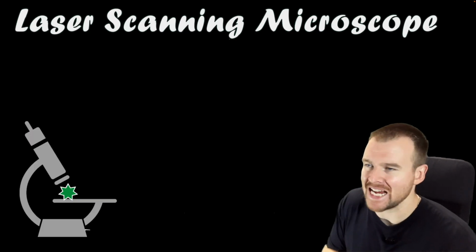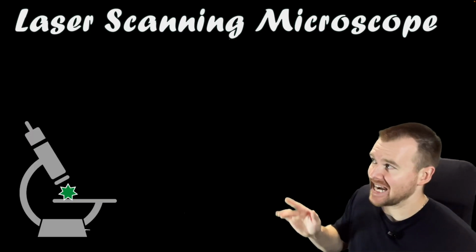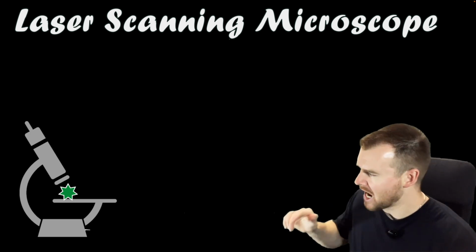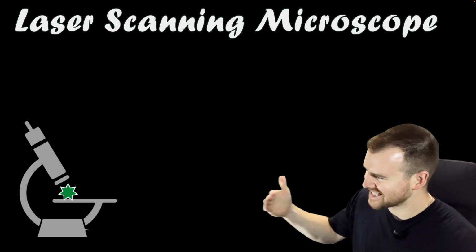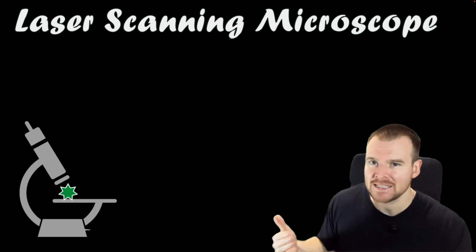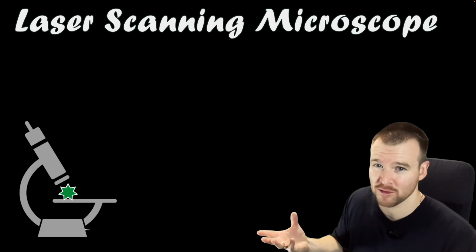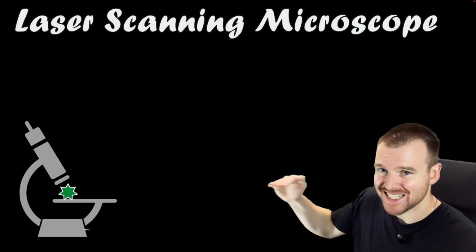Okay, last one for light here is our laser scanning microscope. This one seems the most intense, and it kind of is the most intense. I have a small picture of the bottom there. We're going to try and scan this image that has some depth to it. Instead of just looking at the surface or shining light through it, because it has to be pretty thin to do that, it's going to try to scan it in layers.